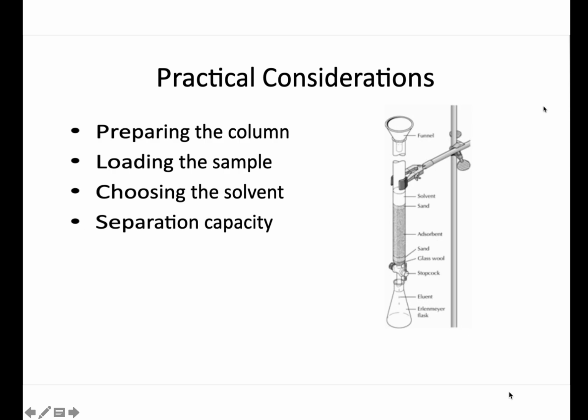And fill it with the mobile phase, then flush it. Why do you have to flush it? In order to pack and compress the stationary phase. Then cover with a little bit of sand, just 3 to 5 millimeter.